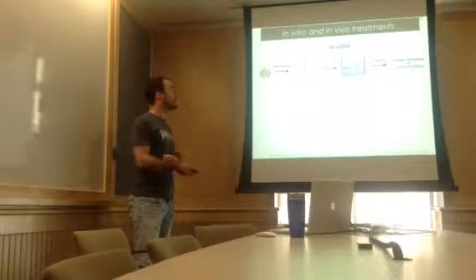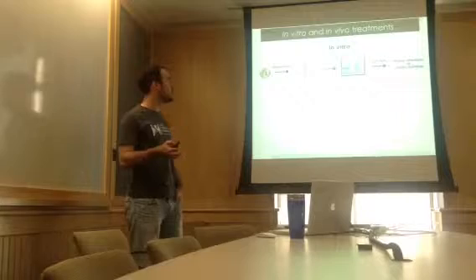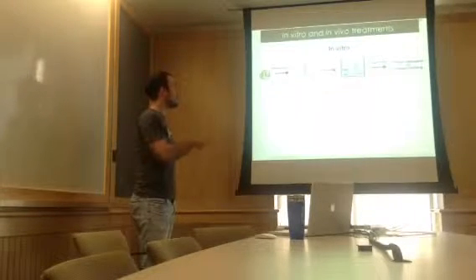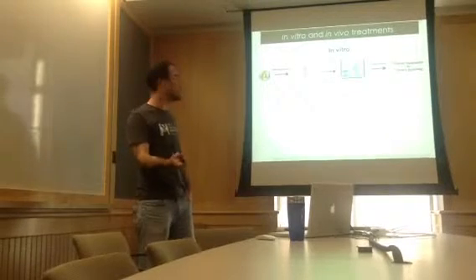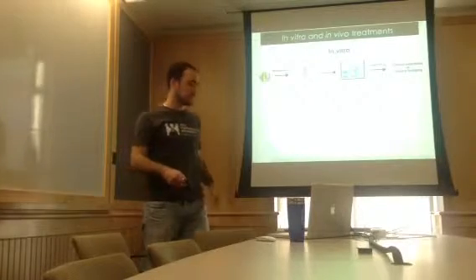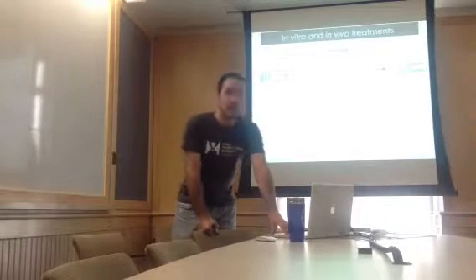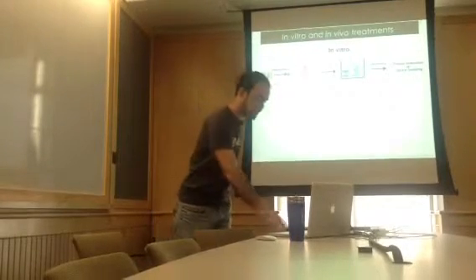So now how do I treat the embryo to probe the RNA either in vitro or in vivo? So first in vitro, I take an embryo at a precise stage that I want, I extract the total RNA, and it is this total RNA that I pre-fold in a pseudo-physiological buffer that contains DMS or NAI, which are our probing agents. And then I stop the probing reaction by quenching and then analyze what the modifications are, either by primer extension or library preparation.